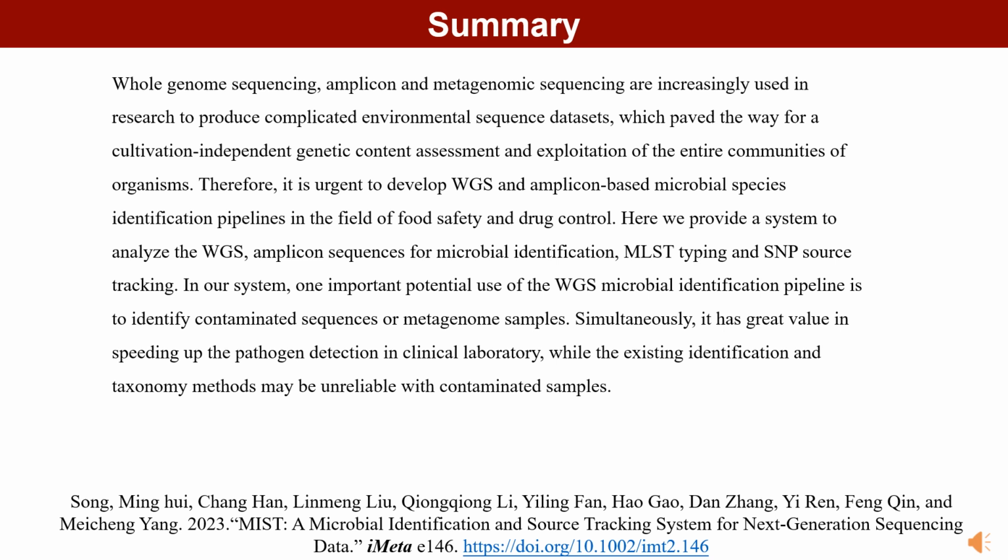It has great value in speeding up pathogen detection in clinical laboratories, while the existing identification and taxonomy methods may be unreliable with contaminated samples.